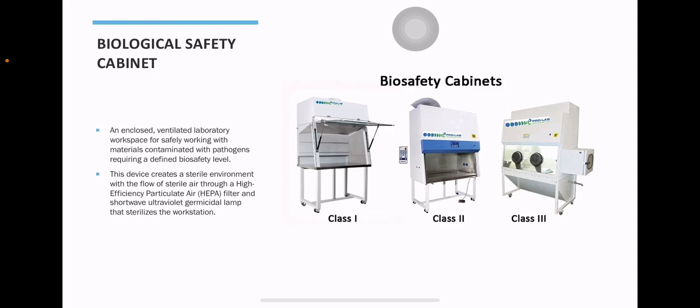For the protection, it protects the personnel, the product, as well as the environment. So everything. The airflow is inward, plus it has HEPA filtered laminar downflow. So both the intake or the downflow and the exhaust air are HEPA filtered. Typical use is usually for clinical microbiology laboratories, handling pathogenic organisms such as biosafety level 2 and some biosafety level 3 organisms. Most bacteriology work is done here.